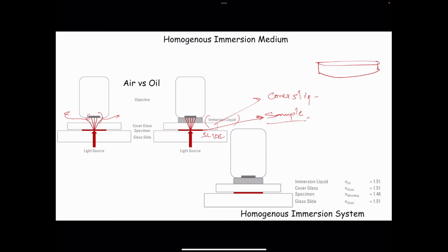And the thickness of this is a few micrometers. The culture tissue, which is about 30 micron, is still transparent. There are several brain slices that someone may want to study, which are several hundred microns thick with medium transparency. It is not very transparent.